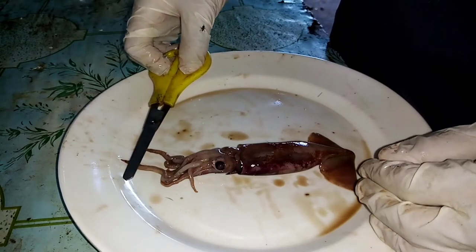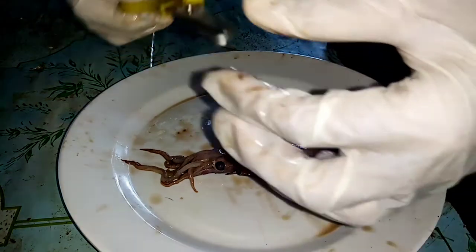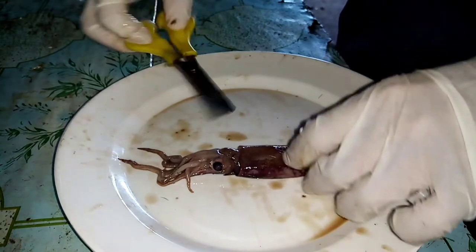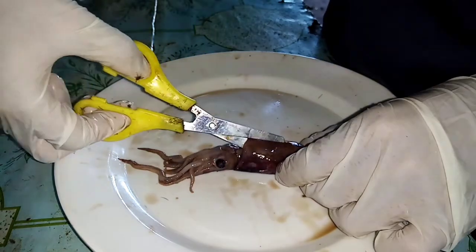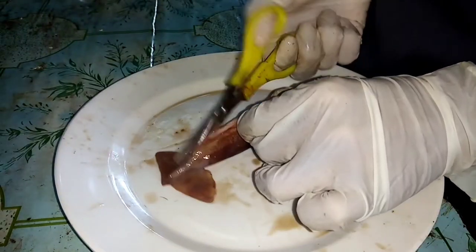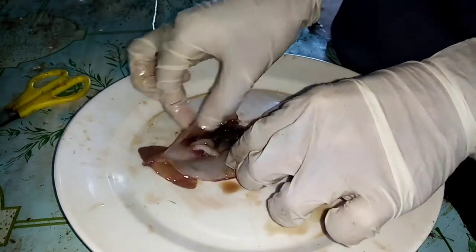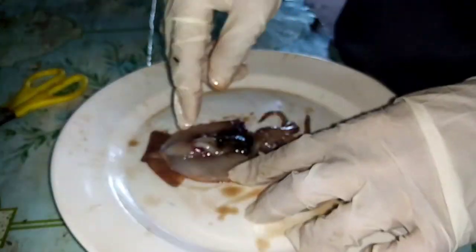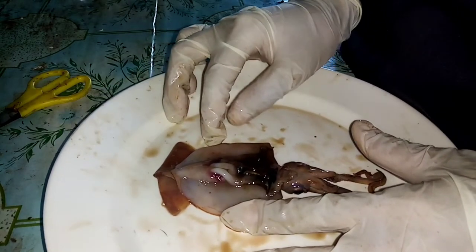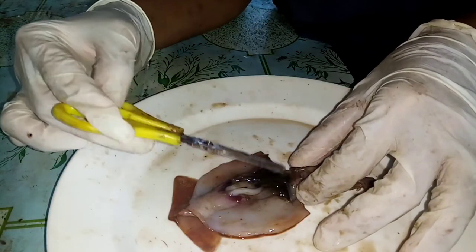To identify the internal parts of the squid, I'm going to cut the mantle, and instead of a scalpel, I'm going to use the scissors to cut it. So these are the internal parts of the squid. So let me have first this one, this part.